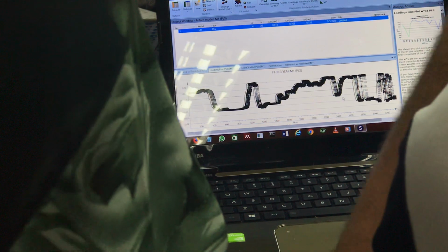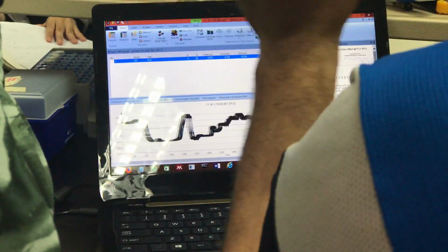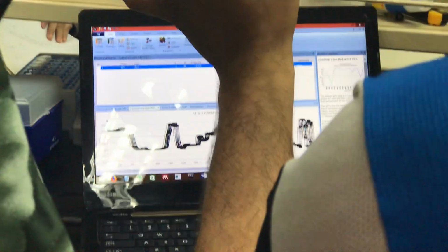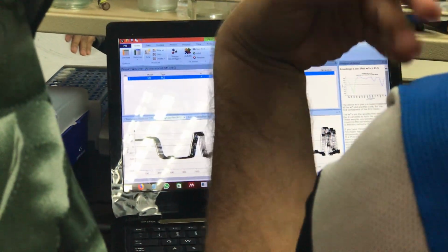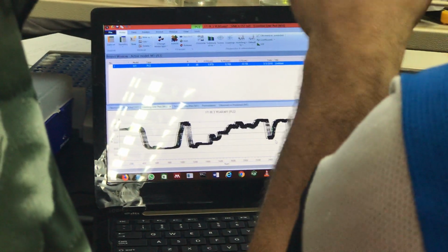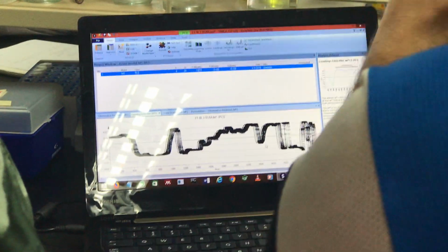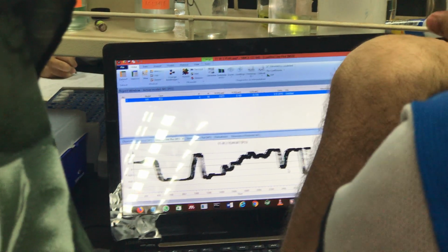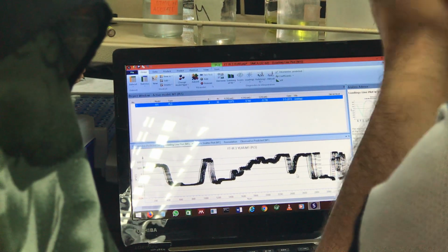Because I told you, when I give the software the data, it gives me 0 components. There is no difference. When it tells you 0 components, that means it is already rejected from the beginning, before we go to the prediction and validation. From when we ask the software to run the data, there is no difference. From 0, from the beginning, it rejects the data.